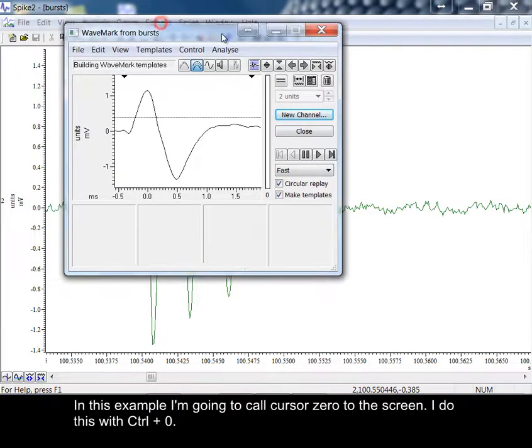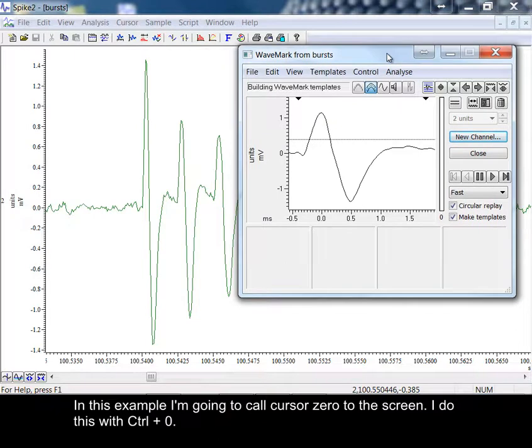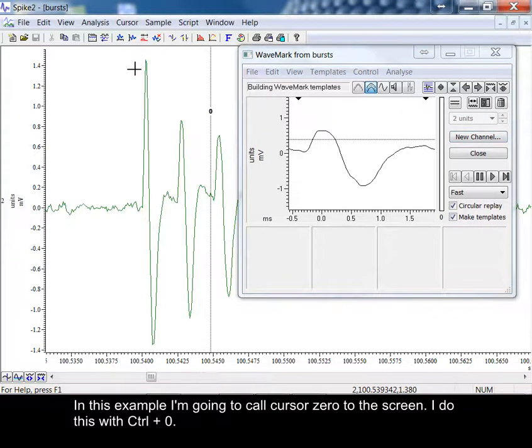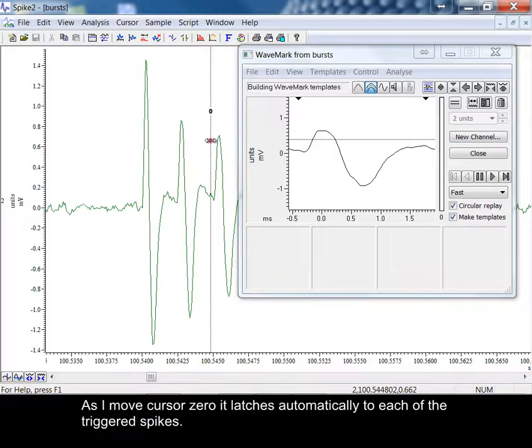In this example, I'm going to call cursor0 to the screen. I do this with control and zero. As I move cursor0, it latches automatically to each of the triggered spikes.